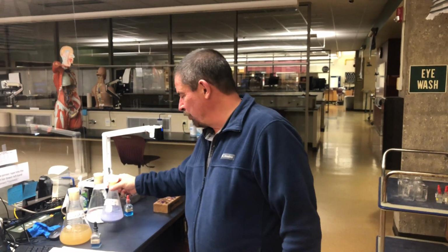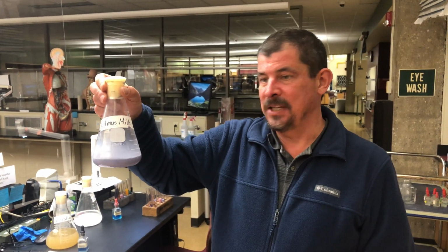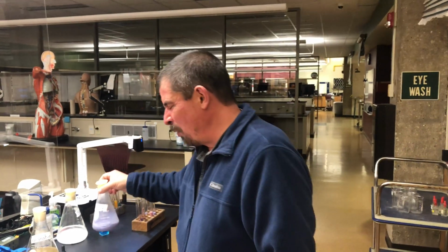And what we will do is take this and pour it into 2 test tubes. Okay, and again, do not worry about how many milliliters we use. We're not going to test you on that, folks, but we're going to add basically equal parts of this milk and litmus solution to 2 test tubes. And then in one of the test tubes, in fact, in test tube number 3, we're going to add the pancreatin.